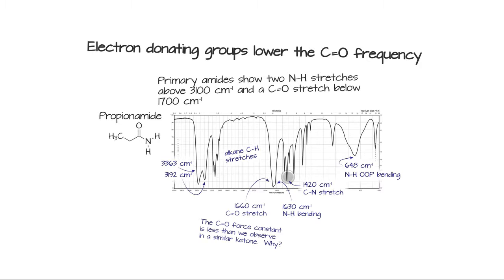There's a carbon-nitrogen stretch that can sometimes be picked out, but it's usually not too strong, usually lost in the crowd. I would go with the amide peak. Amide peaks often have this little sort of split at the top or a little bit of doubling, and often that has to do with the carbonyl peak combining with the NH bending frequency. So anyway, just a little kind of tick there also helps you spot the fact that it's an amide.